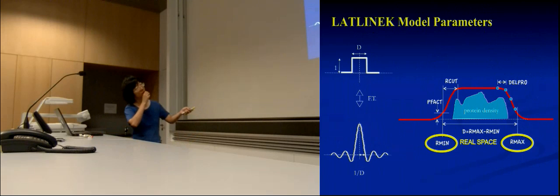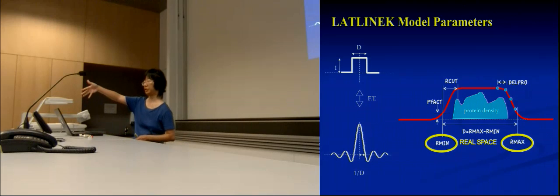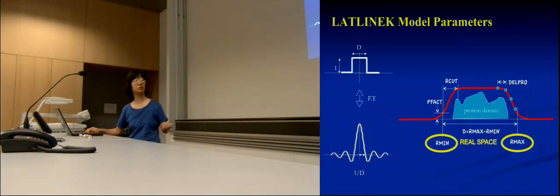It's defined with Rmax and Rmin, not just as a d value, because if let's say you have something that doesn't have a twofold axis in the z direction, then you don't expect that going from the origin is going to have the same distance to the other side.